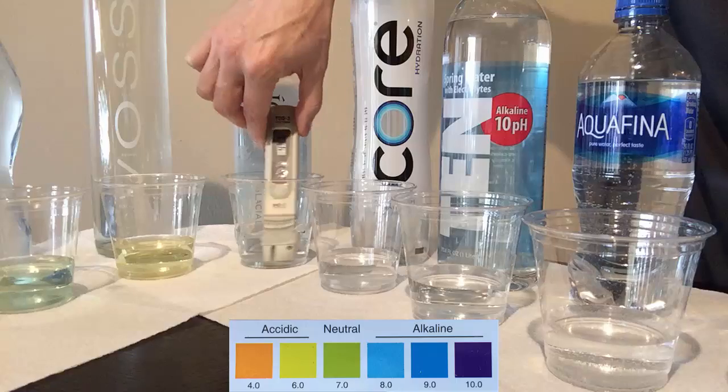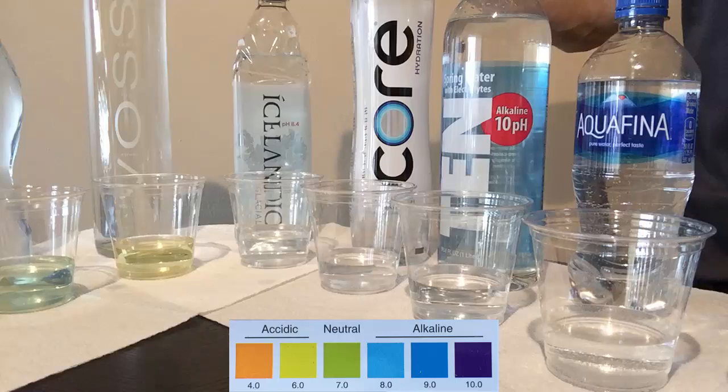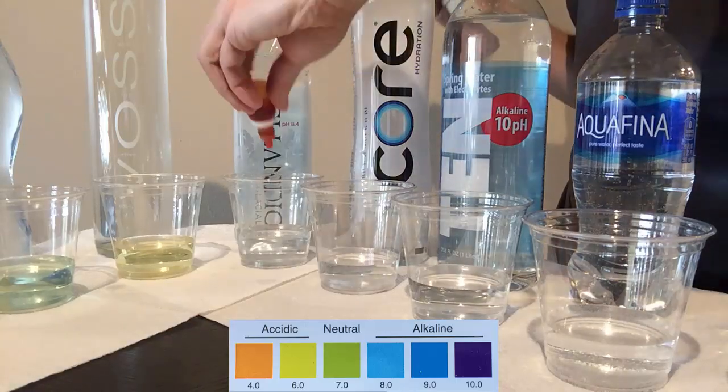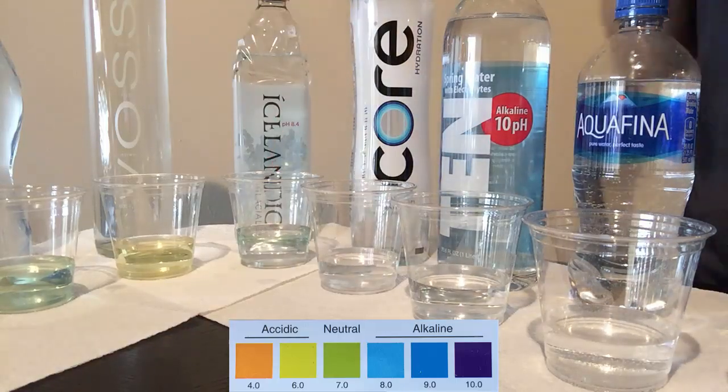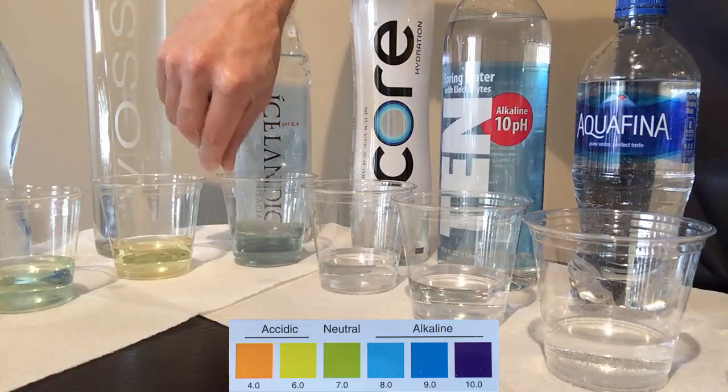Icelandic natural spring water comes from Iceland, and the bottle claims natural alkaline water at 8.4 pH. I measured a TDS of 47, which is just fine, and the alkalinity was somewhat bluish, so I'll give it an 8.